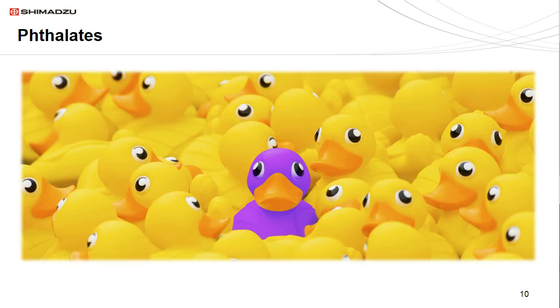Innocent child's toy or hazardous substance carrier? Possibly both? Well, this has nothing to do with the possible germs on the toy, but more so its composition. See, toys like this are filled with things like plasticizers that affect the toy's physical properties. What we will discover in this next application is that children's toys are not the only culprit for hazardous substances.